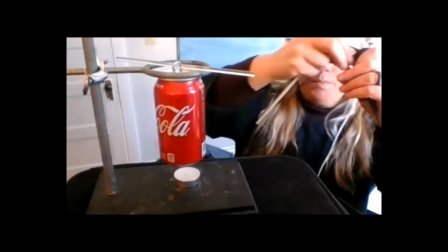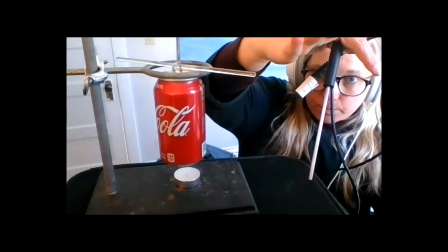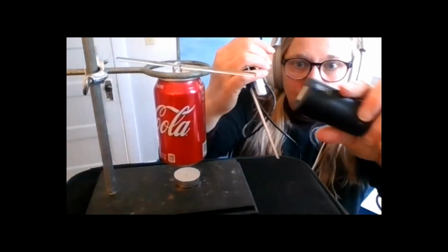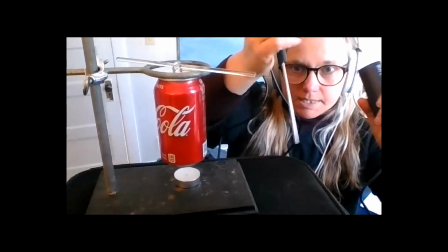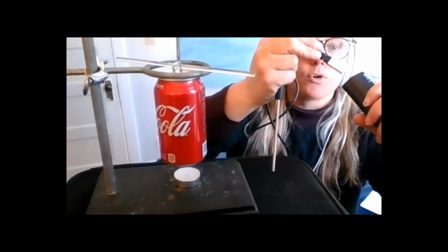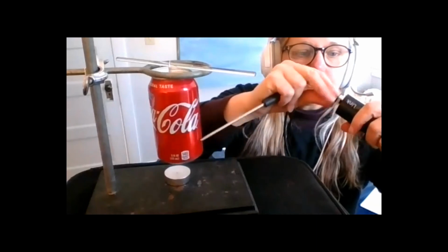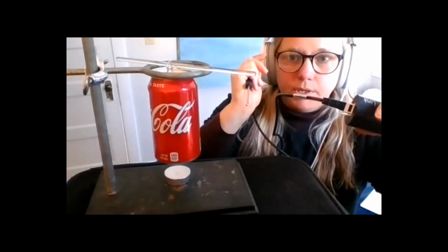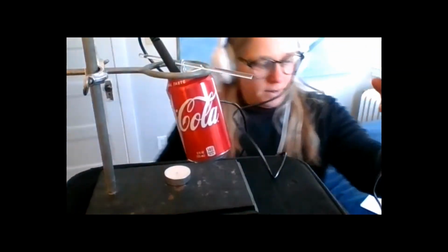First, there's 2 parts. You've got this part, which is the actual temperature probe. And then you've got this funny Go Link thing. That's the interface that plugs, so that it makes this able to plug into your Chromebook. So what you're going to do is plug this into your Go Link. There we go. Plug that into your Go Link. And now this thing is getting ready to go into your can and just be there.